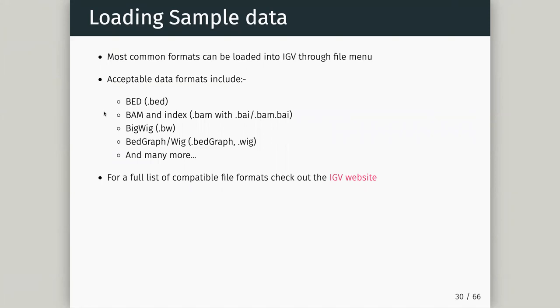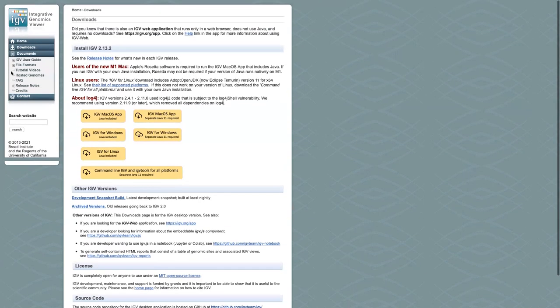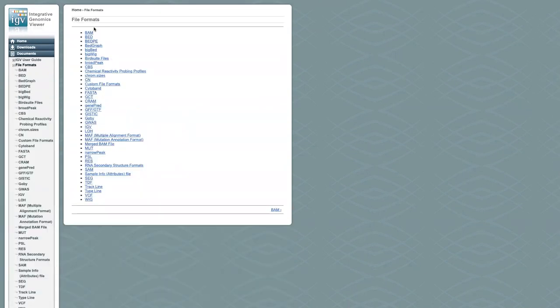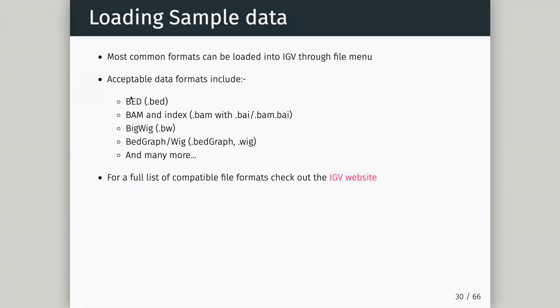Most common data formats can be loaded into IGV - their website lists all supported file formats. These include the ones we're really interested in: BAM, BED, BEDGRAPH, BIGWIG, VCF, and MAF (mutation annotation format). IGV does a good job covering major file formats. We're primarily interested in BED, BAM, BIGWIG, and a few others like GTF.